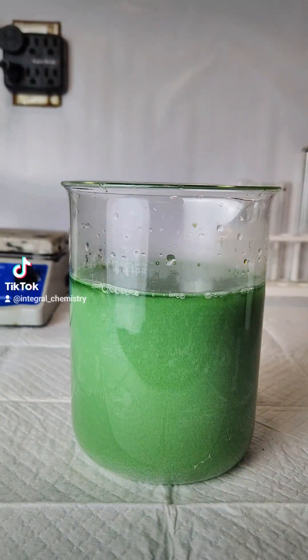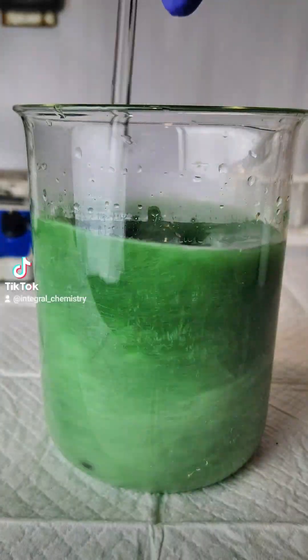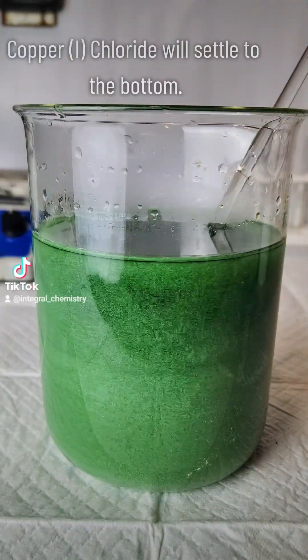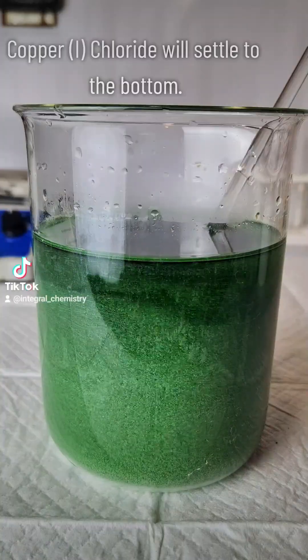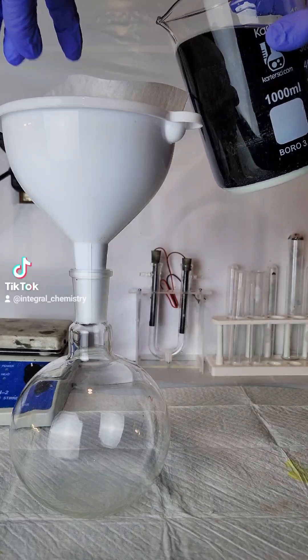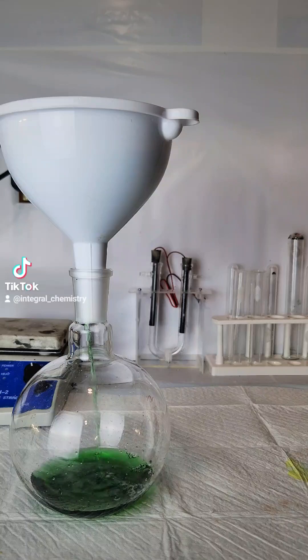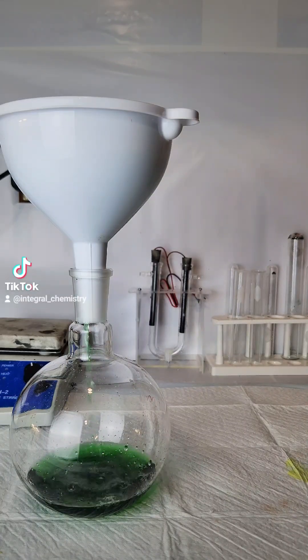Now if all I wanted to do was separate my copper and my nickel, at this point I could just add stoichiometric quantities of aluminum to solution to precipitate my copper, filter that off, and then add more aluminum to precipitate my nickel out of solution, and I'd be done. However, I think it would be fun to make some copper chloride along with some copper iodide, so that's what I'm going to do now.